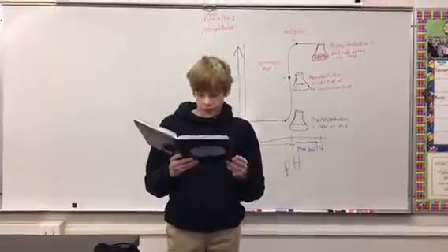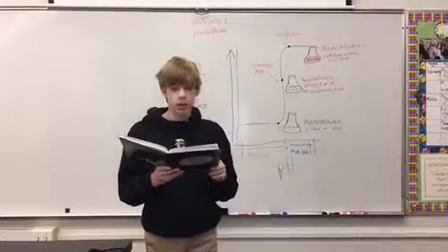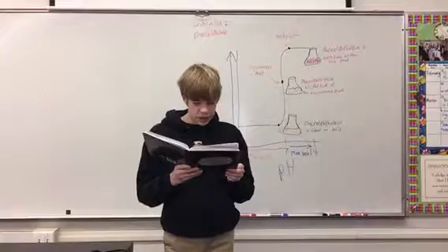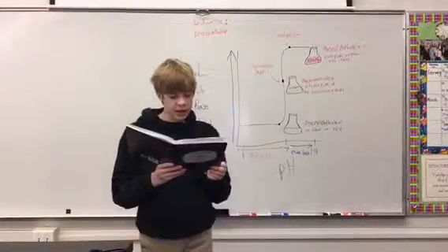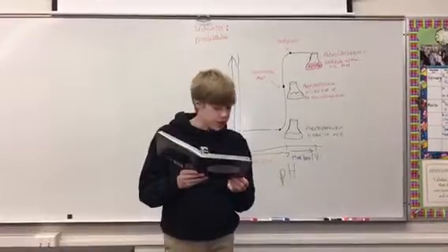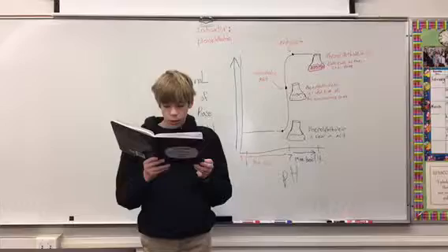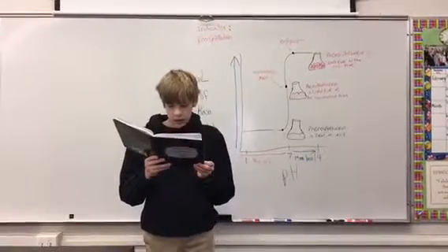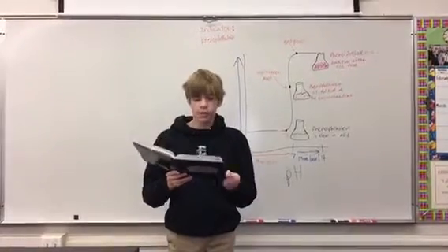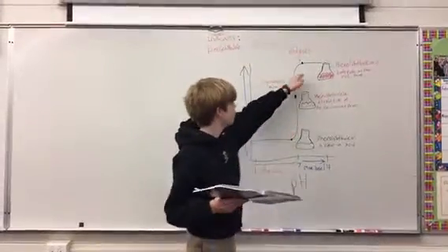The equivalence point is the point at which the 2 solutions used in a titration are present in chemically equivalent amounts. A person knows when the equivalence point has been reached because the indicator in the mixture will turn the color it would show in a neutral solution. The endpoint of the titration is the point at which the indicator changes color to the color it would show in a basic solution, like up here.